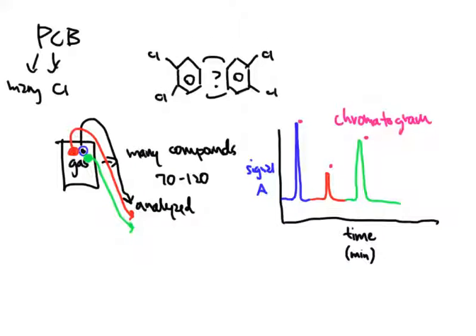And that's again because this can slightly change depending on what type of GC you're running. But it's some type of signal. Some type of detector is on the machine detecting things in a way that might be slightly different than another detector. And because of that, that unit will fluctuate. It will change depending on what you're using.